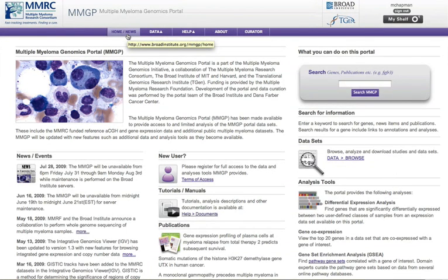This is a demonstration of running gene set enrichment analysis via the portal. Please note that your titles and colours may differ from those shown here, however the steps of running the analysis will remain the same.